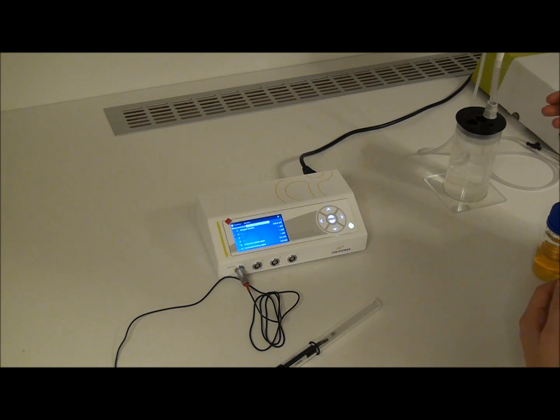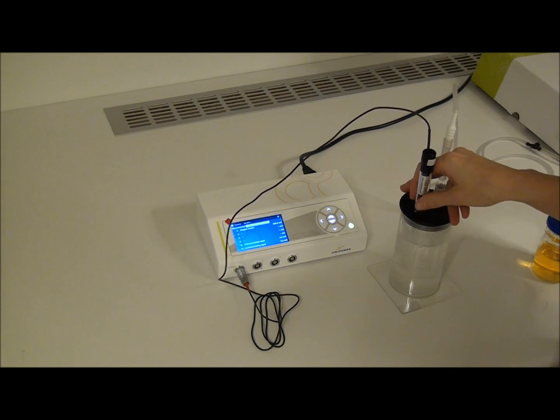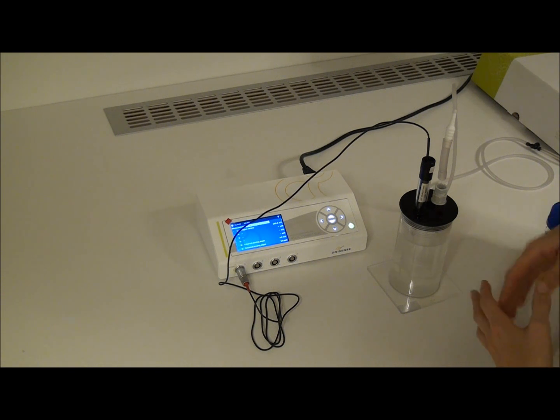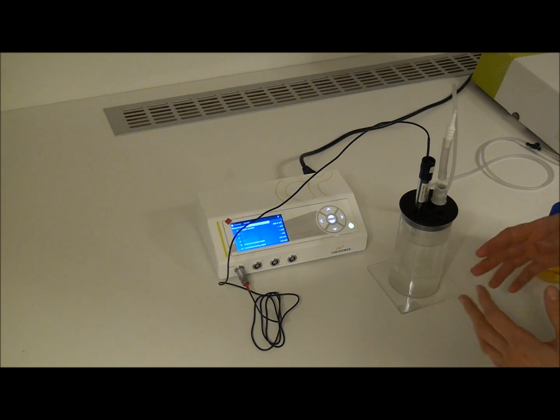You will perform a two-point test reading the sensor signal in an oxygen saturated solution. Here I am using the Unisense calibration chamber where tap water has been bubbled with air for five minutes. Wait until you get a stable signal and read the signal.